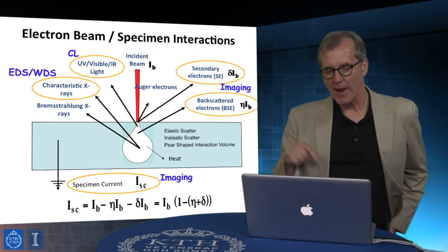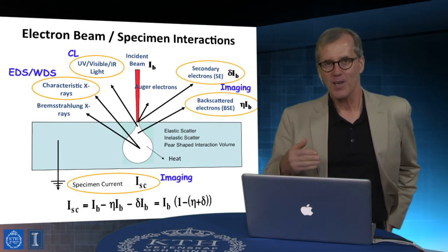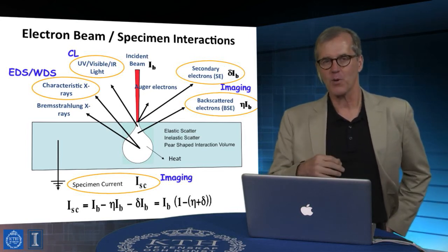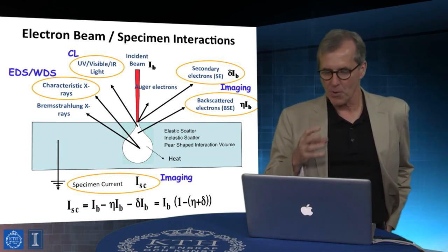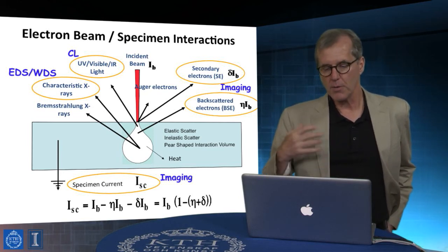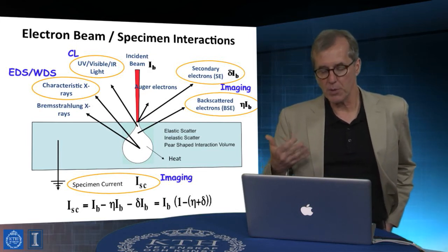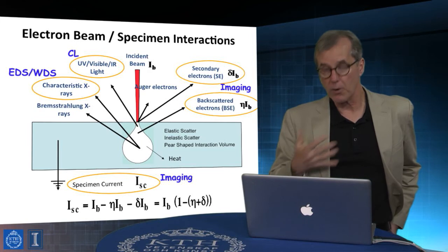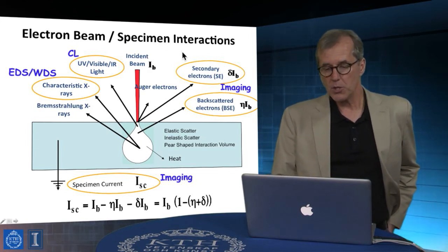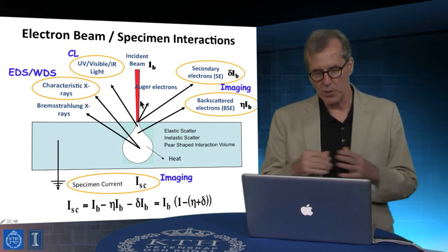We should also talk about how electrons interact with matter. I've said several times in the course of the lectures that one of the things that's important to understand is that electrons interact very strongly with matter, and that has really important consequences for what we see in electron-based imaging. But there are these correlated analytical measurements that we do using electron excitations that are very important to the character of SEM analysis. So what's shown here is a summation of all the things that we can do.